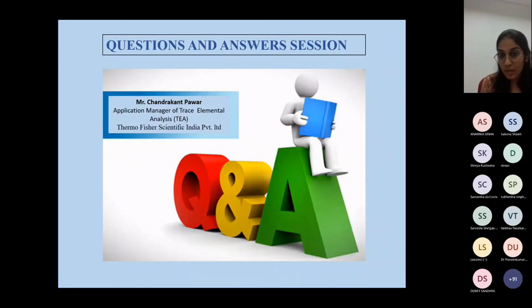Okay. The next question is from Pragya Bedwal. She wants to know whether we can analyze gaseous fuels from this instrument. Right now, madam, I am not using that; we only use solid and liquid samples. Maybe we will ask the factory about the possibility. It is a really nice question. Whatever questions there are like that, we can ask the factory whether any accessories are available or not.